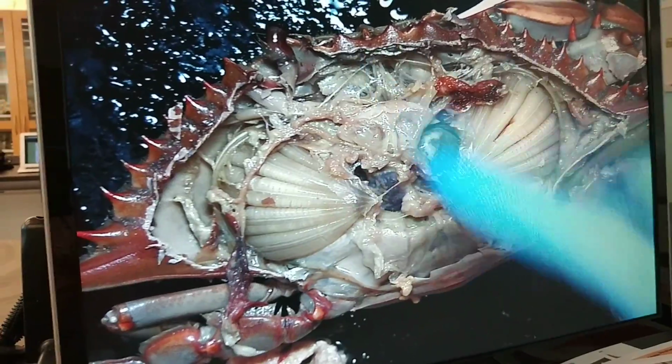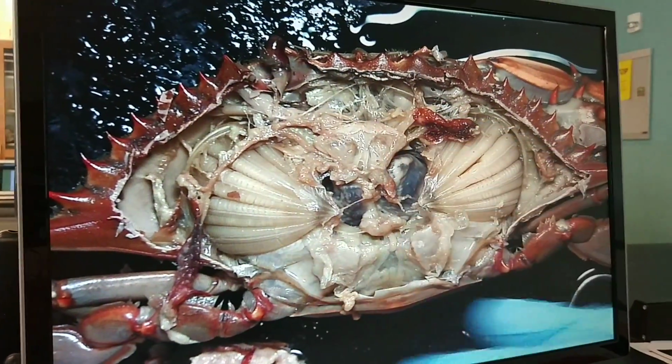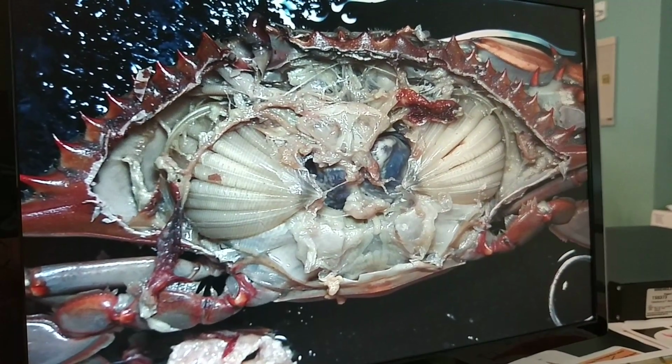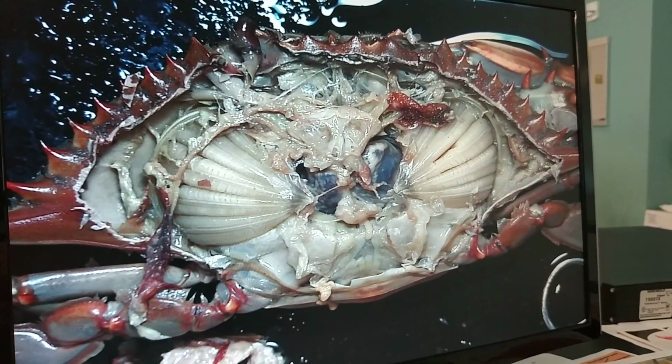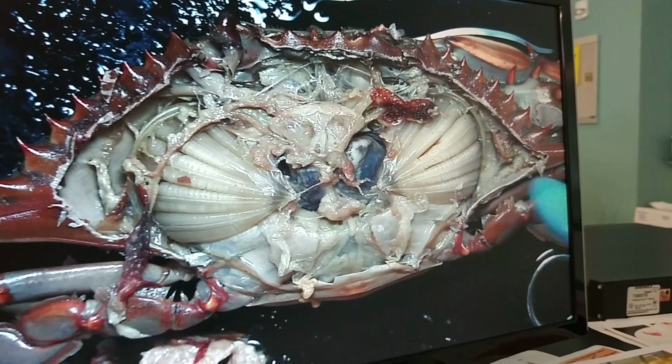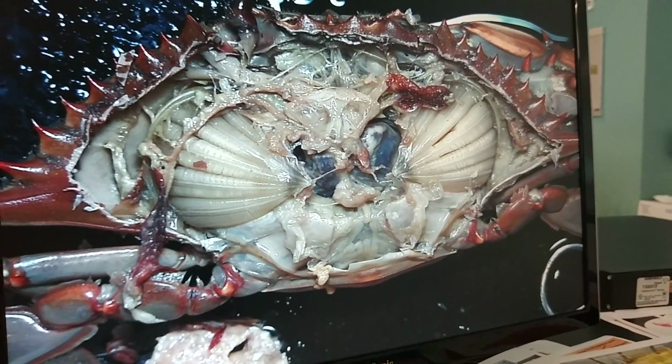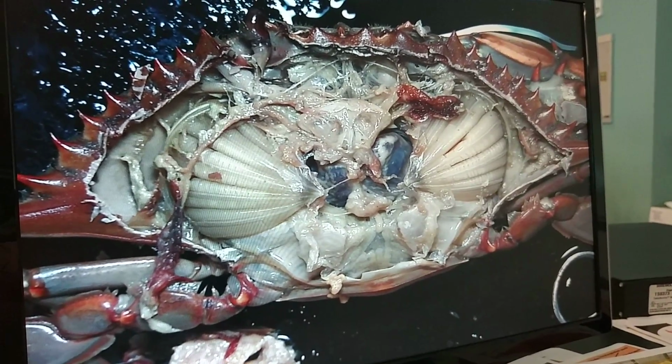I'm not going to ask you about this, but if you think about their reproductive biology, because they hold a bunch of eggs, they still need to produce a ton of sperm. The females can produce a ton of eggs without all of that convolution. Sperm tend to be much, much smaller than eggs.